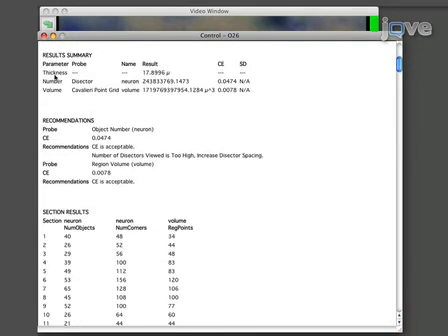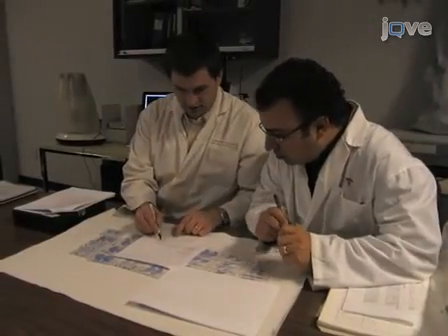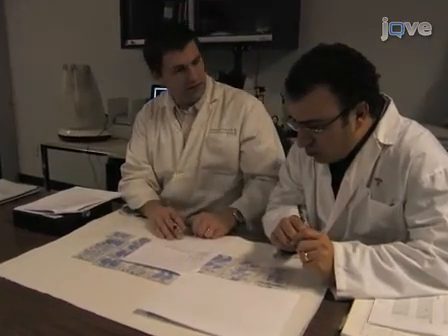Based on these parameters, the system will generate an estimated n, reference volume, and coefficient of errors for both the estimated number and volume. It will also give recommendations to become more efficient or to reduce the coefficient of errors.